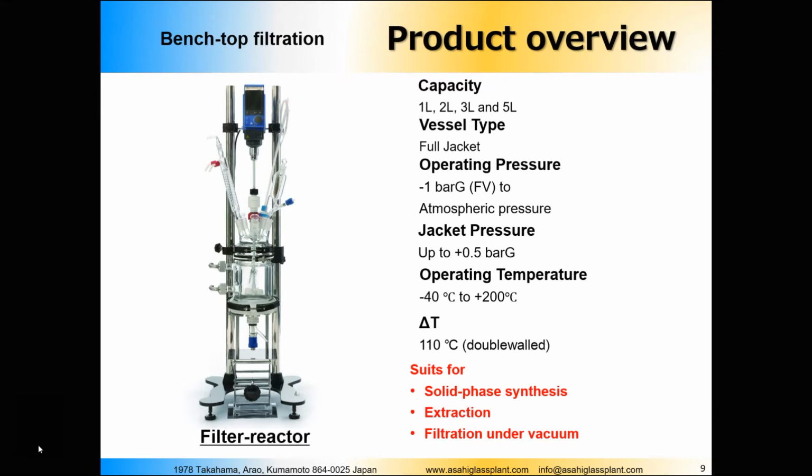And what you do is you put this polymer inside a filter reactor. As the particles of the polymer are relatively large, they do not get through the filter. So first of all, you add amino acid number 1 inside the reactor, and the amino acid gets into the reaction with those radicals, the hairs that are on the surface of the polymer.